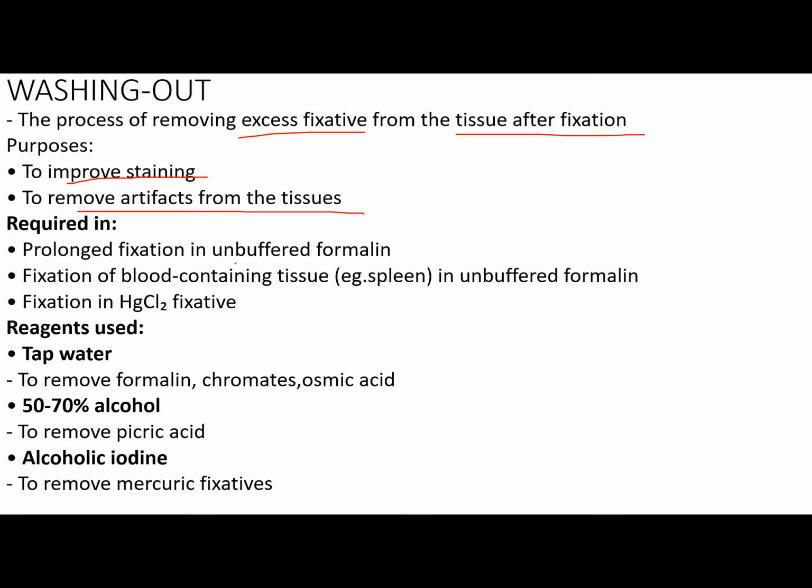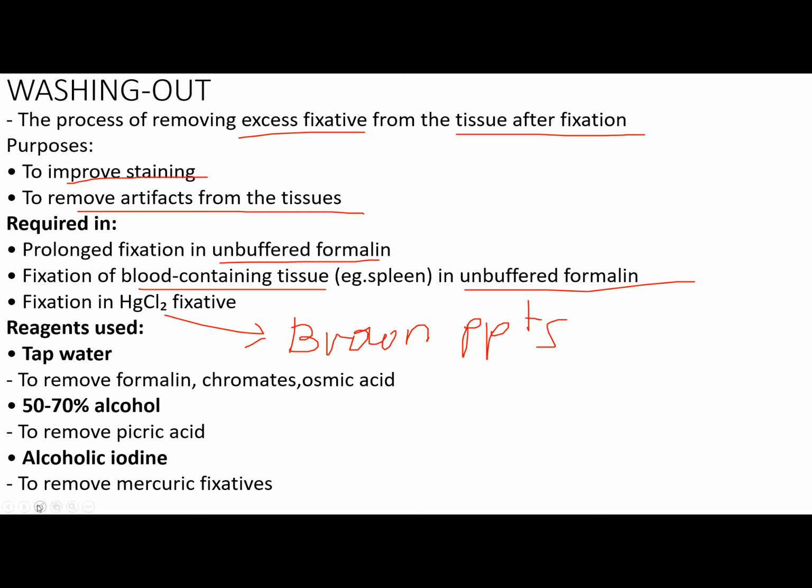It is required in prolonged fixation in unbuffered formalin. So if your formalin is not buffered, class, you need to do washing out. And if you're going to fix blood-containing tissue, such as tissues from the spleen, in unbuffered formalin, and then fixation in mercuric chloride fixative. Di ba nga kasi yung mercuric chloride fixative nyo, nagli-leave siya ng mga brown precipitates. So you need to remove those brown precipitates by using washing out.